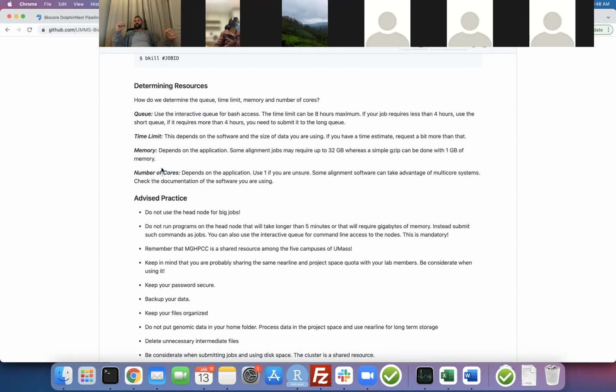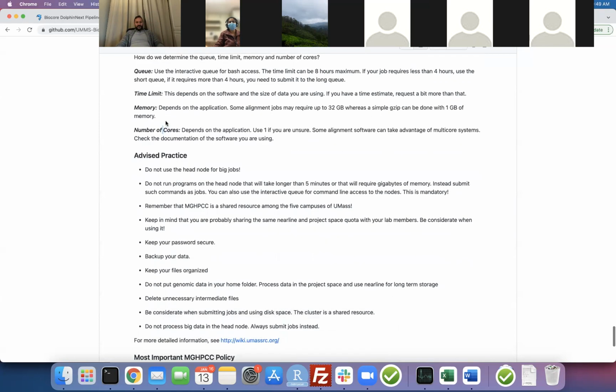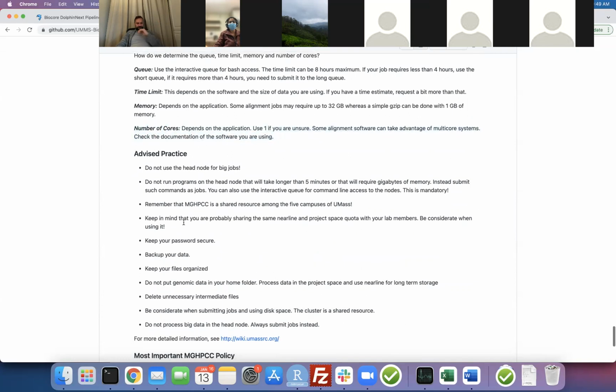So what you need to do is, while running the STAR algorithm, there's also another parameter, like STAR -n or something like that. You have to write the same number there. Otherwise, the default is 1. So you can ask for 4 while submitting the job, but if you don't put that 4 into STAR, it's not going to use that. It's going to use 1. But we're going to do this in 2 weeks, so you're going to learn this.